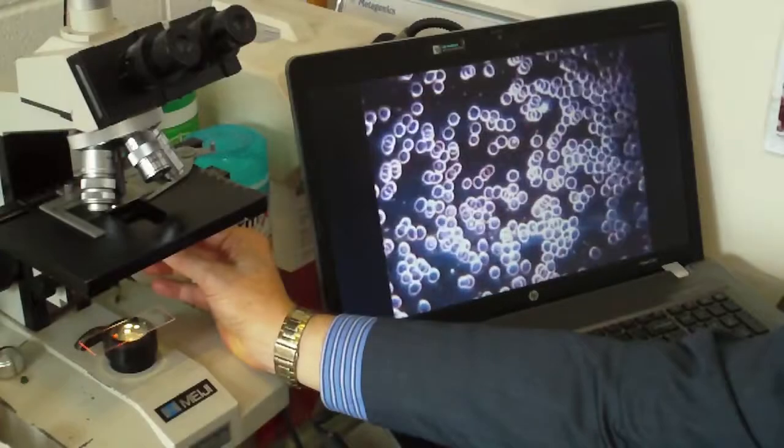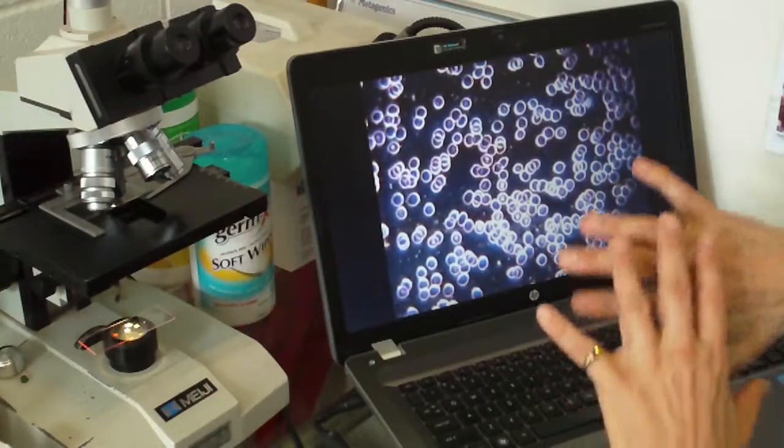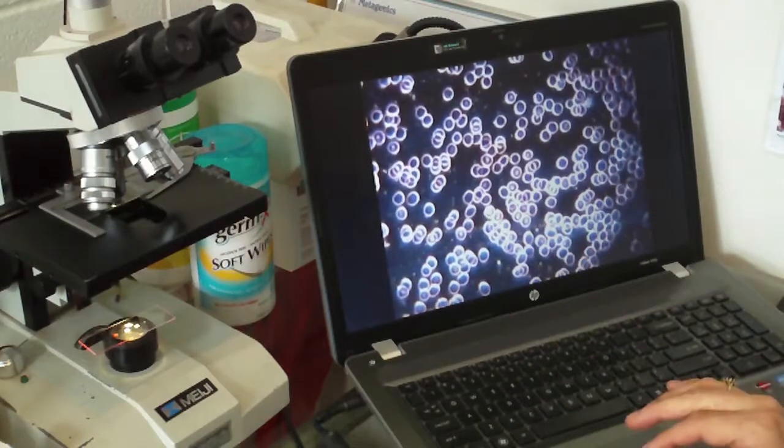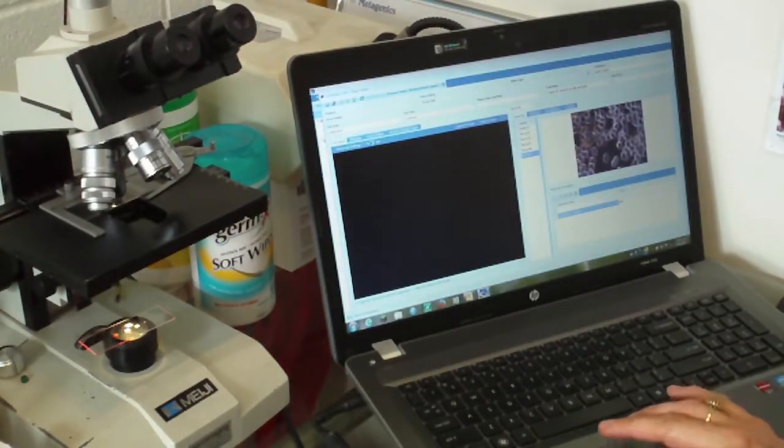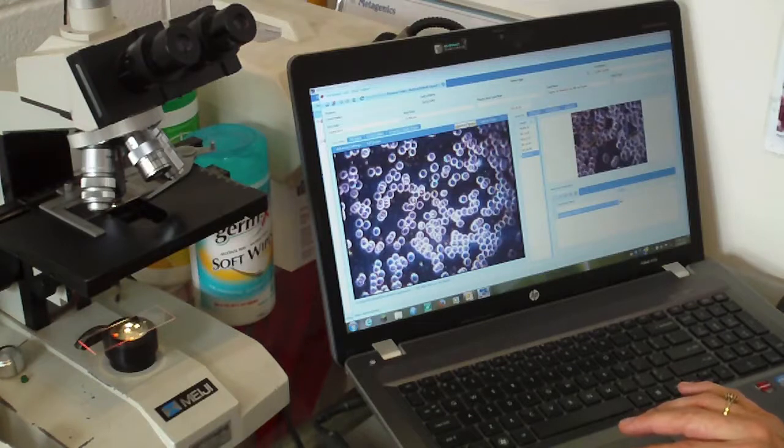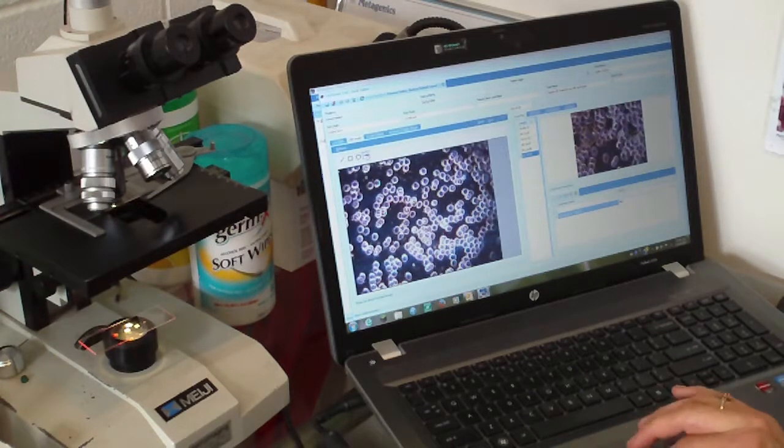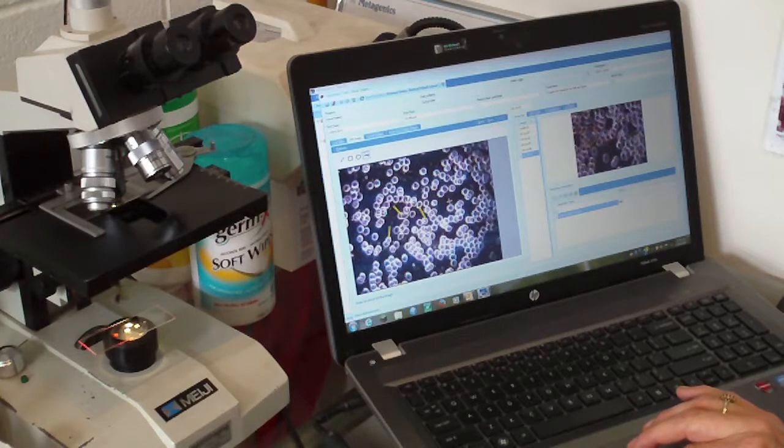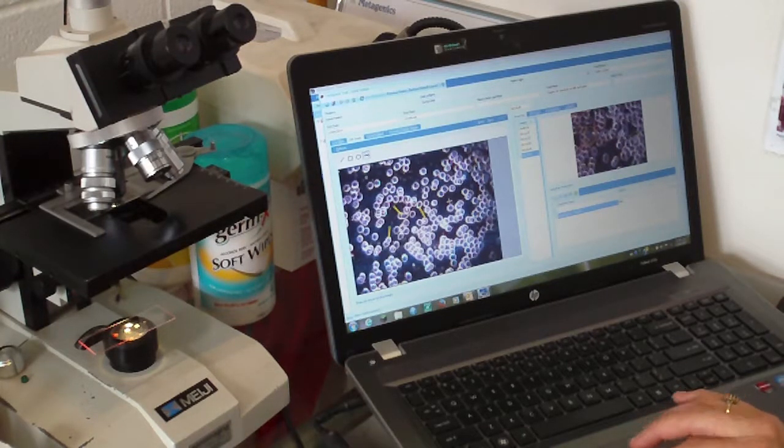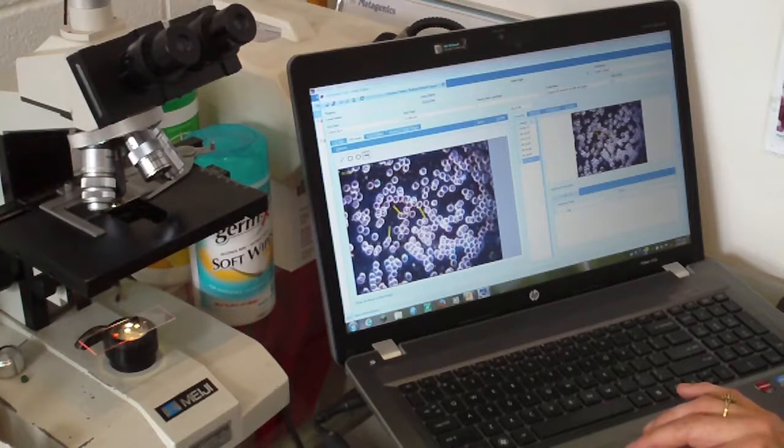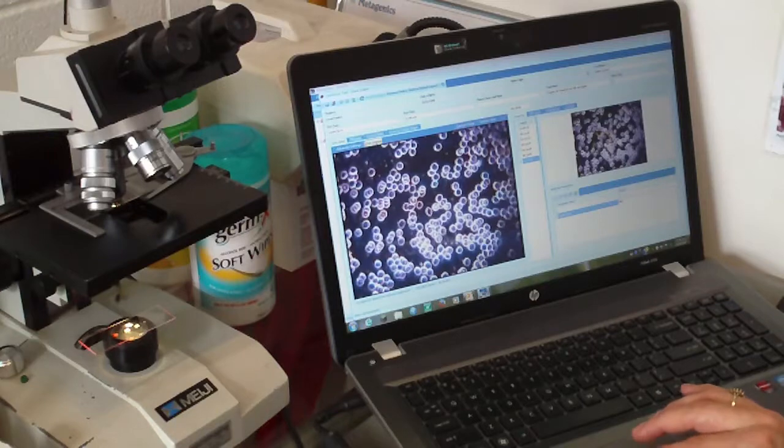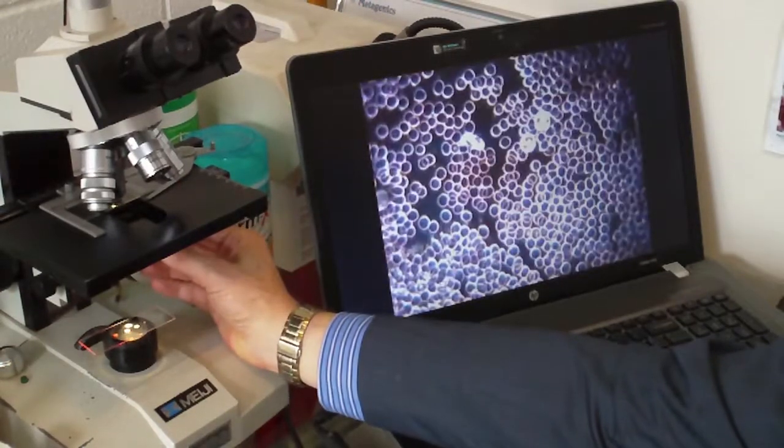That's getting closer to normal, where the cells are starting to separate. These are the red blood cells. Again, you can see there's these annulocytes. So this particular patient is a bit low in iron, and so needs to dose up on it. So I'm going to capture those again. And there's a couple of other signs. If you look carefully where I'm pointing the arrow, you can see some of these cells that are a little bit misshapen. Not a lot, but a few. So that indicates that the patient is a bit low in B vitamins. Not hugely. So they would benefit from a higher dose of B vitamins in their diet or supplementation.